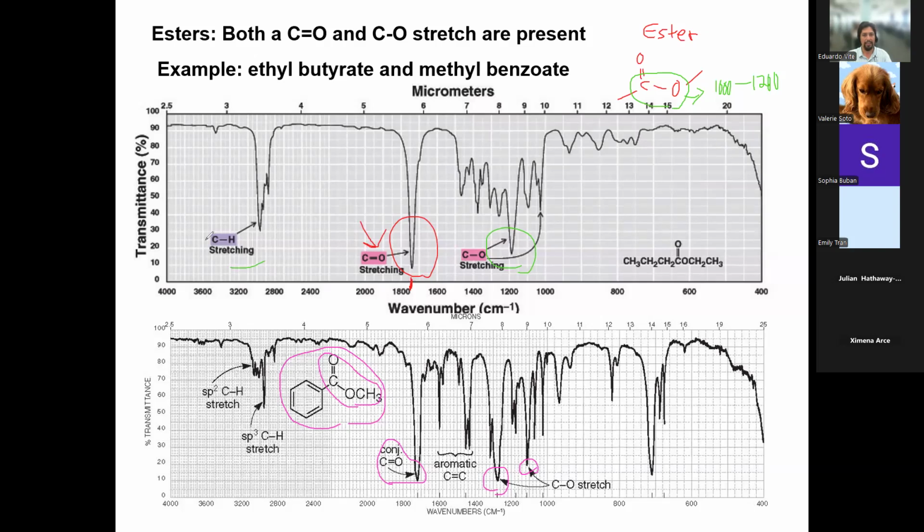Here in the light blue, again, we have our CH stretches at 3000. Yay, we have an organic molecule. It doesn't really tell us anything. What about here? Well, notice how these are sharper. That's part of this ring right here. Remember, aromatic rings usually make the spectrum much sharper. And you will also look for some foothills up here. And so these foothills tell you, along with the sharpness, that this is most likely an aromatic compound. And what does aromatic mean? It means there is a benzene ring for now.